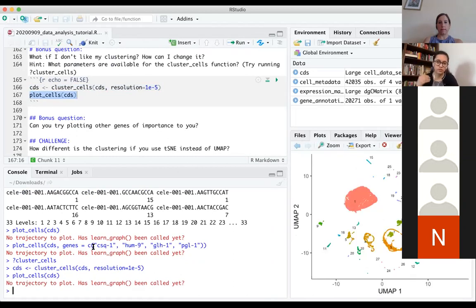And I'm running through this section, but what you can do is download both the plots and see the differences, the previous plot and the one with the resolution parameter as well.